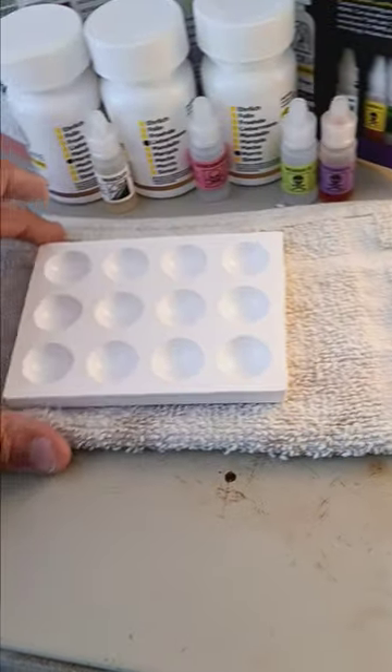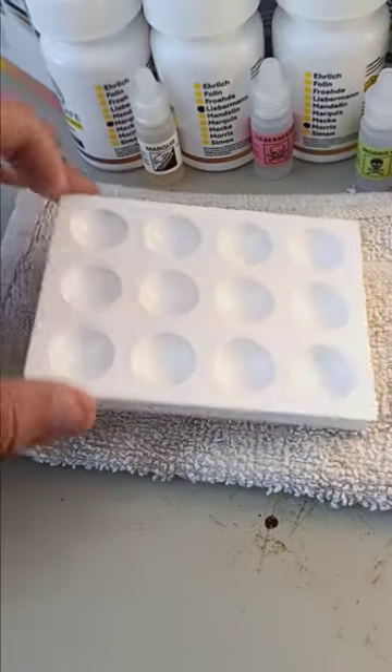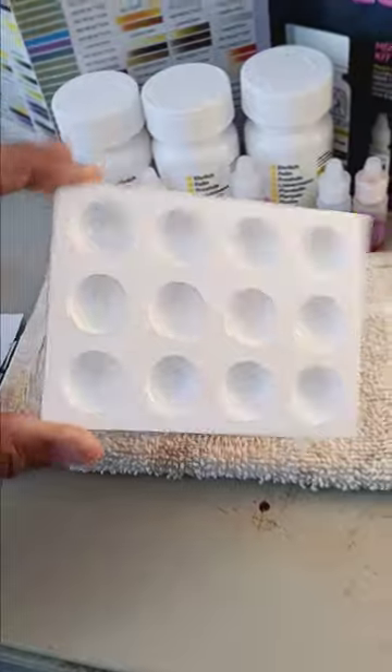Now, moving forward, I decided to pay the extra $10 or $15 — can't remember exactly — and go ahead and get the little lab plate. I like it. Simple, nothing crazy.